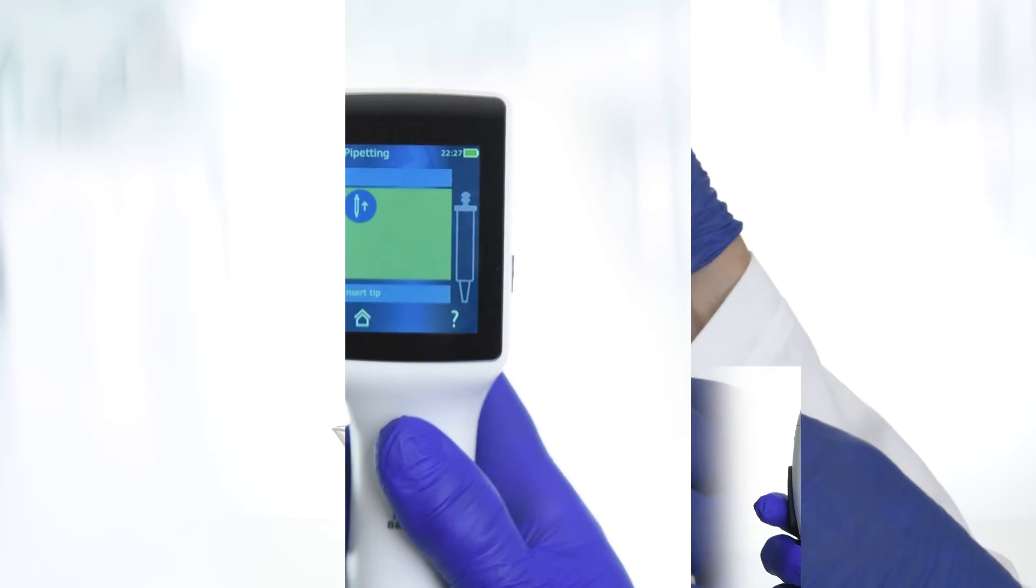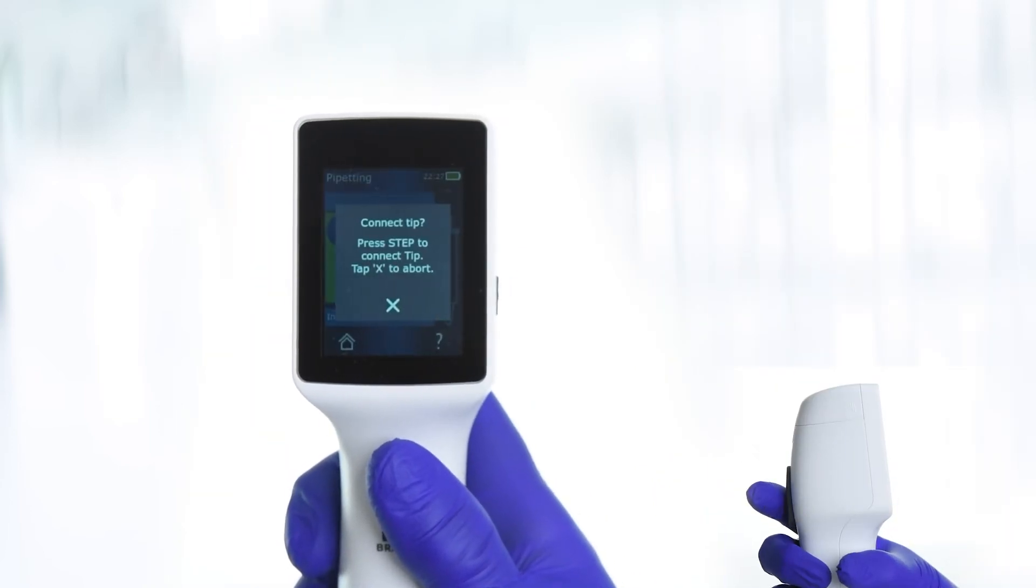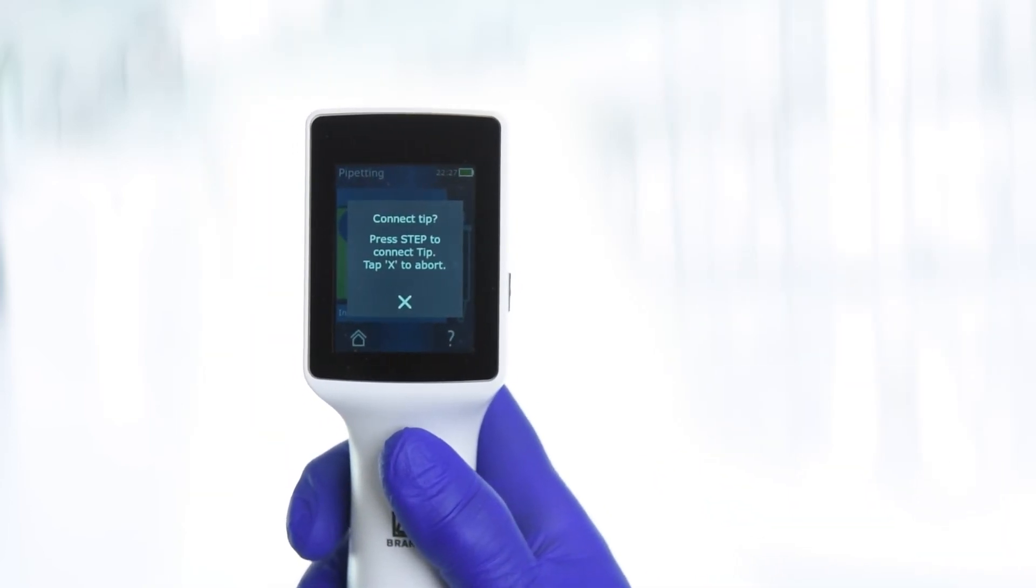Insert a PDTip 2 and press the Step key to confirm. The PDTip volume is automatically recognized.